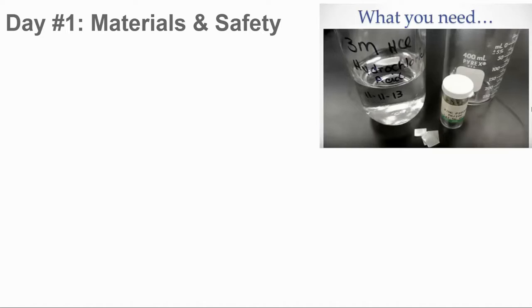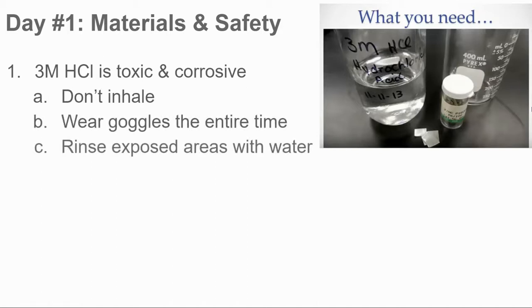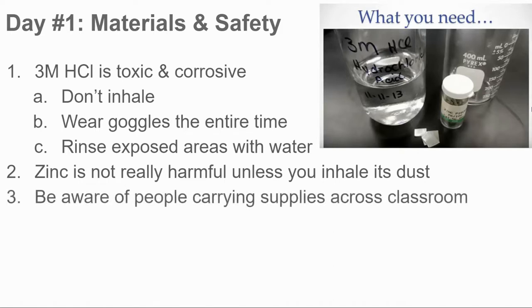So day 1, some materials and safety. Hydrochloric acid was 3 molar. It is toxic and corrosive, so you want to be careful. You don't want to inhale it. You want to make sure you cover your eyes and rinse any exposed areas with water. Zinc isn't really harmful unless you inhale the dust, which wasn't really an issue since we were dealing with fairly large chunks. But do be aware of people carrying supplies across the classroom, which was less of an issue given our small groups.